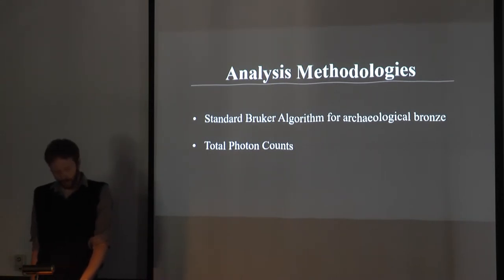It is the most accurate methodology for measuring chemical composition, but only when you already know exactly which elements are in your sample. If the algorithm compensates for elemental interactions that do not actually exist in your sample, then your results will be skewed and inaccurate. This, of course, creates a paradox because you can't build an algorithm until you know how much of each element is in your sample, and you can't calculate an accurate elemental composition until you have an algorithm.